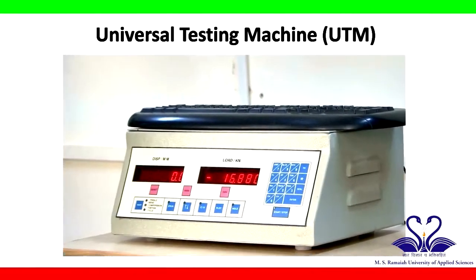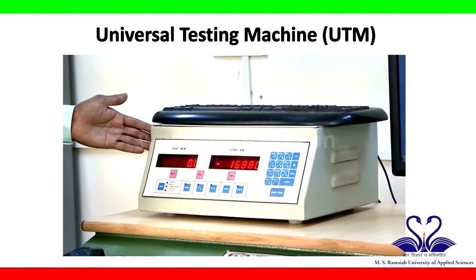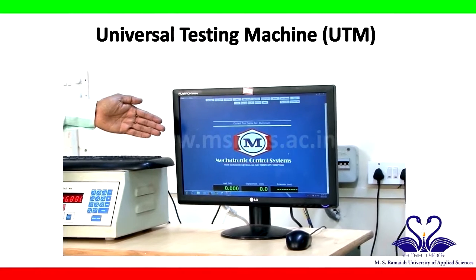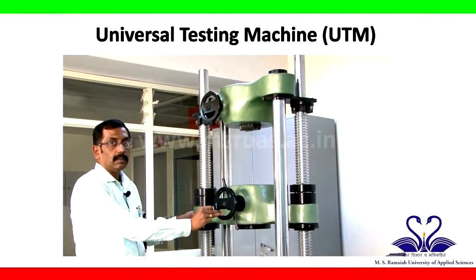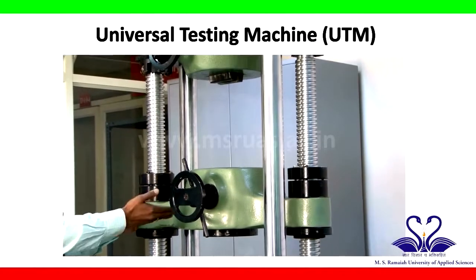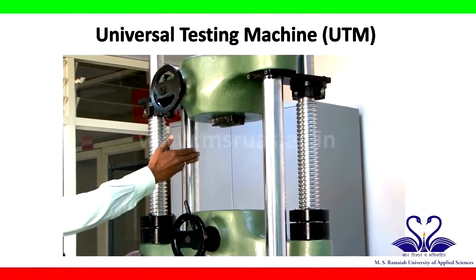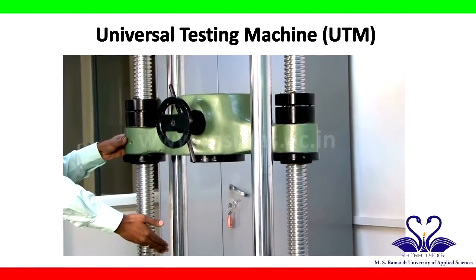The data is decoded and it is captured in the software. This is the middle crosshead, will move up and down to accommodate different sizes of the sample, plus to conduct tensile test and compression, bending and shear.